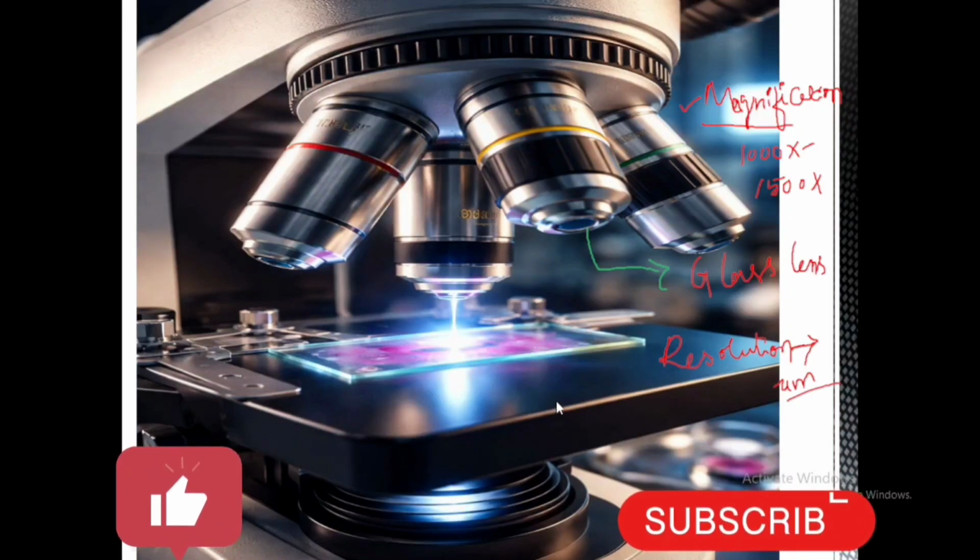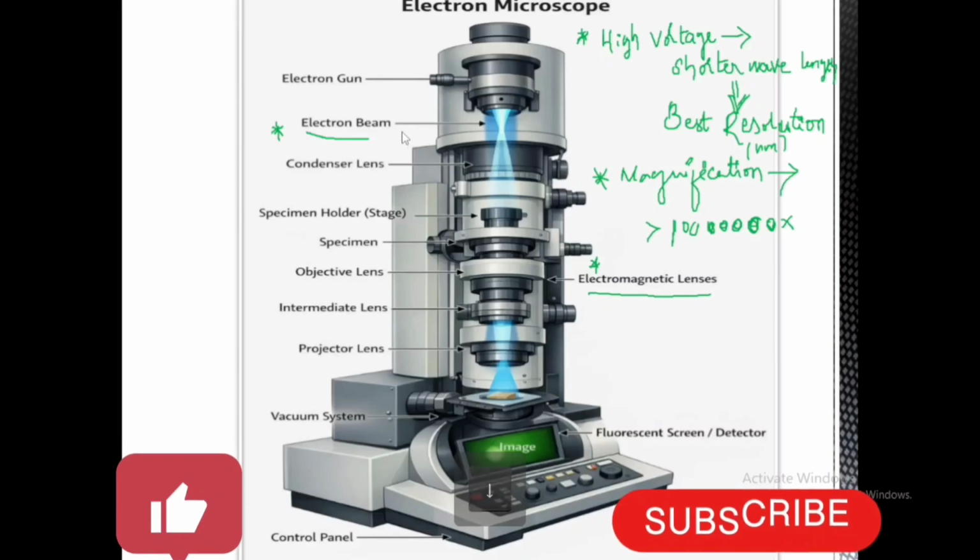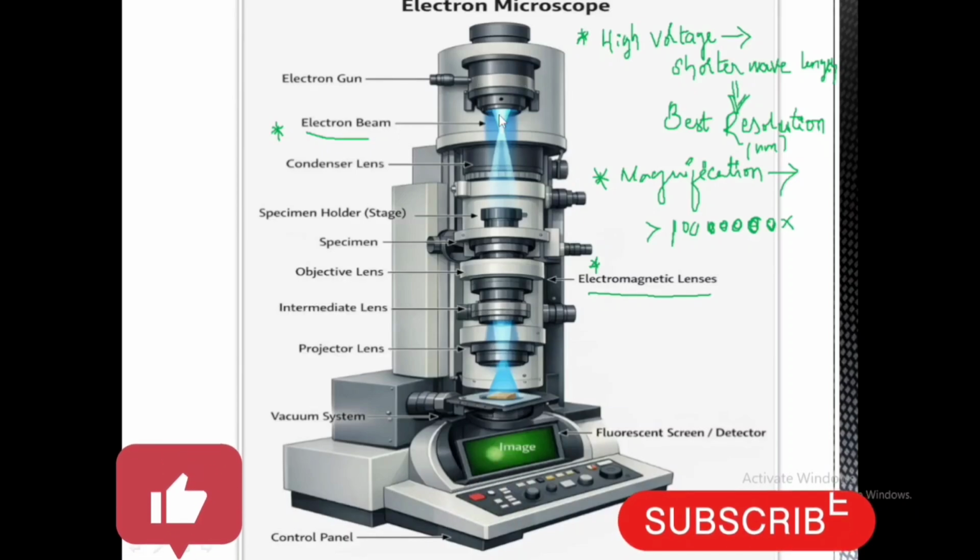Let us recap. Number one, the radiation source. In the light microscope, the radiation source is visible light. In the electron microscope, the radiation source is the electron beam. The electrons are emitted from the electron gun. Inside the electron gun, the heated tungsten filament is present, and it emits the electron beam.